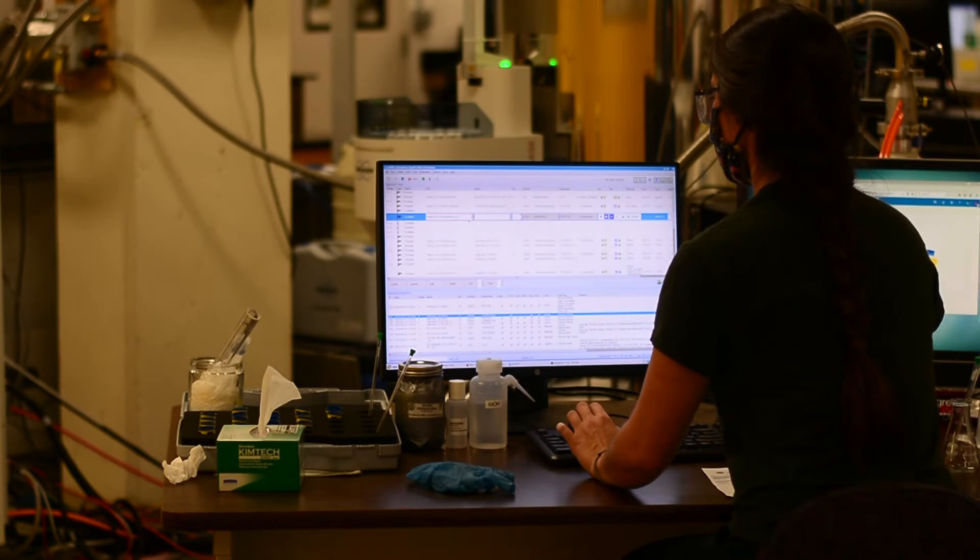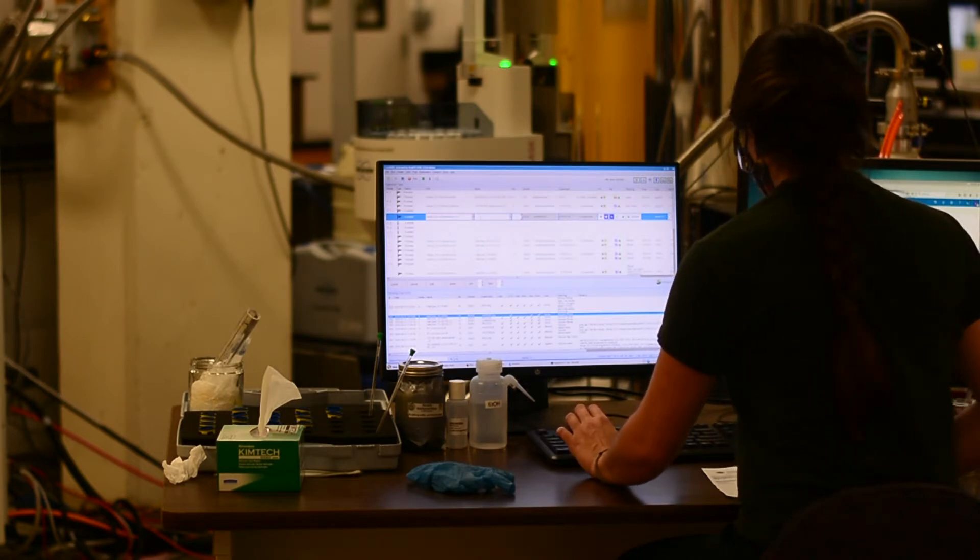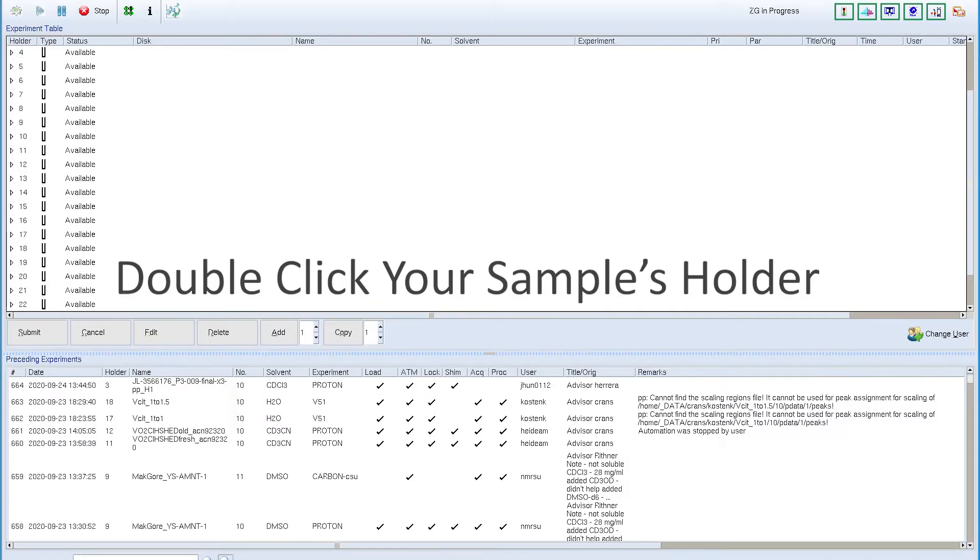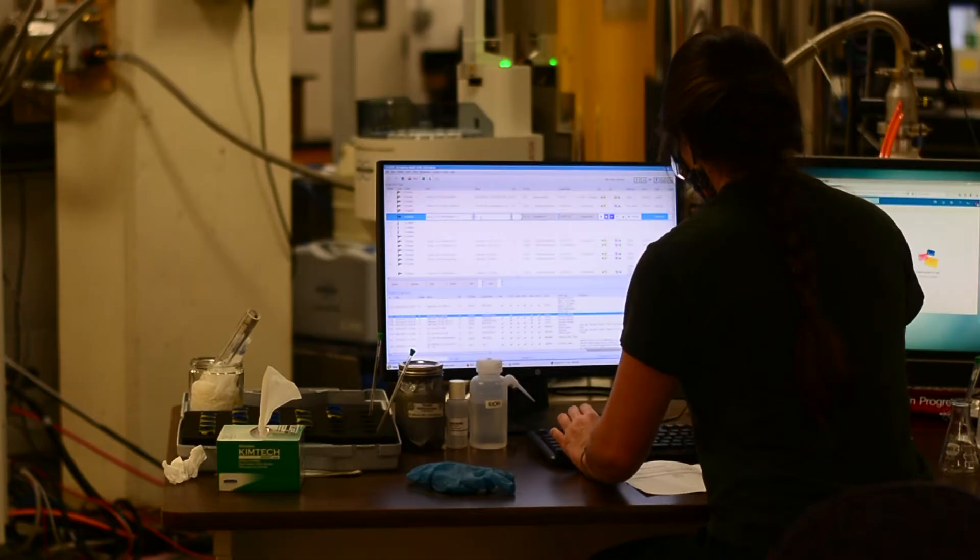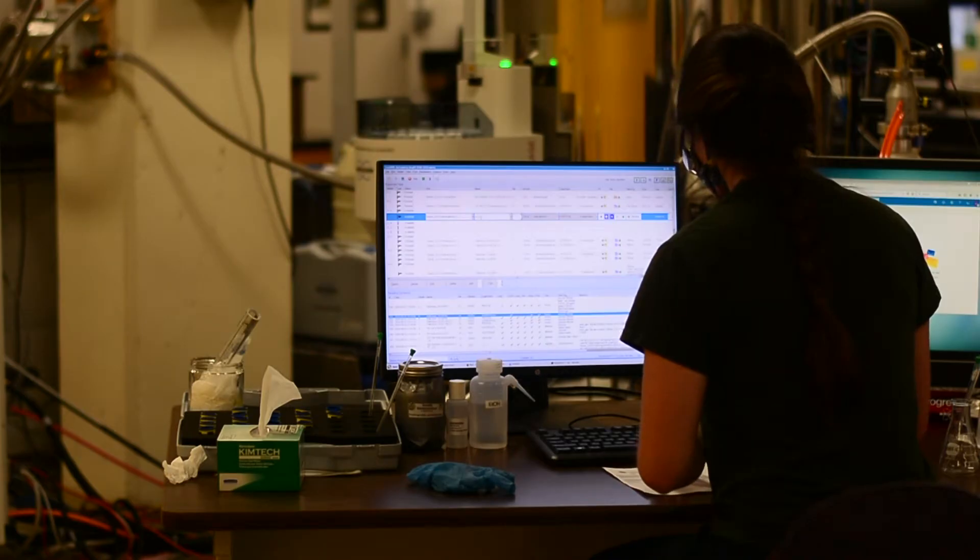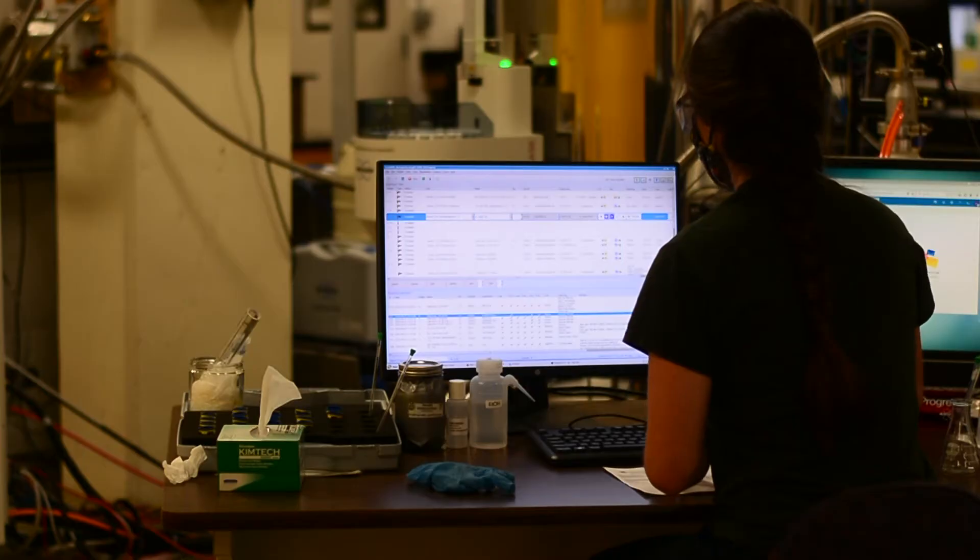Select the position in the software that corresponds with the position that you loaded your sample in on the auto sampler, and add a new experiment by clicking the add button on the software.